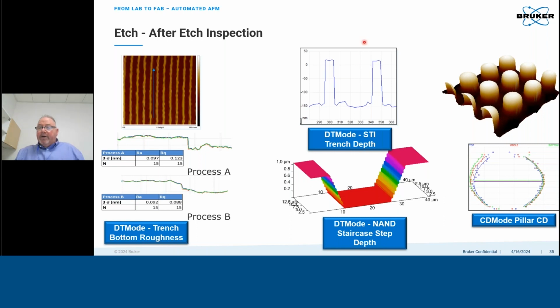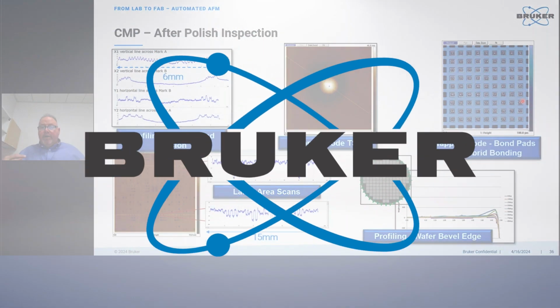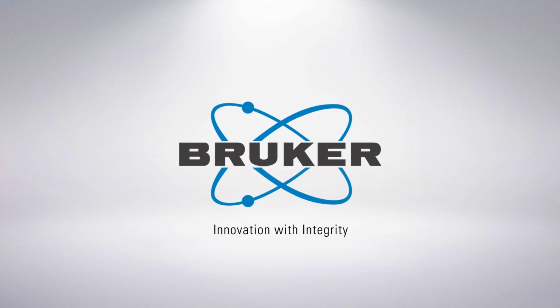And then lastly, another unique kind of application would be for pillars, looking at the full pillar morphology and profile. So this is, again, a CD mode application where we are looking at pillar height, pillar diameter, top, middle, and bottoms. CMP, this is really the home of large area scanning, profiling, and tapping mode.